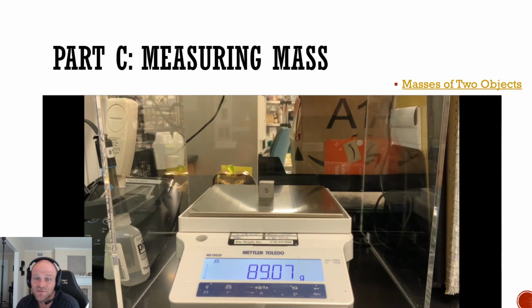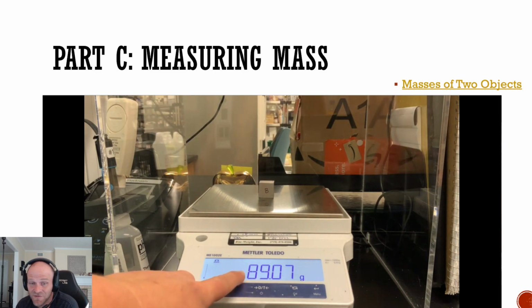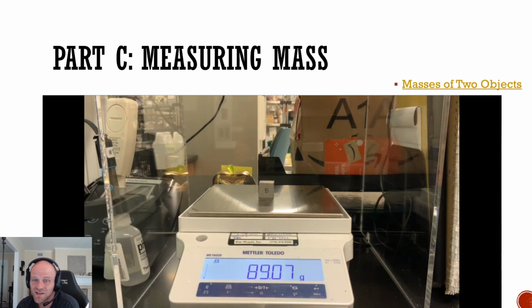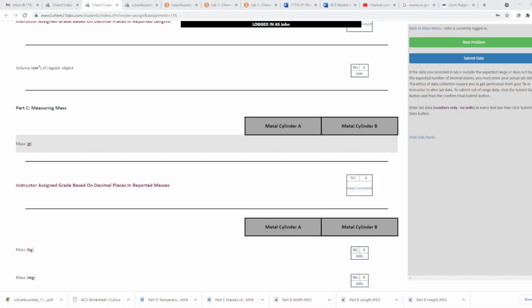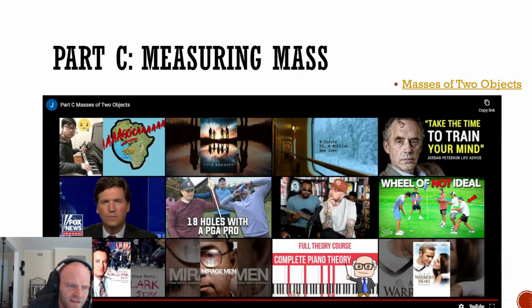Alright, there's object B. You see they're roughly about the same size, but much different in weight. So make notes of those on your Chem 21 report sheet here. And then that's it for part C.